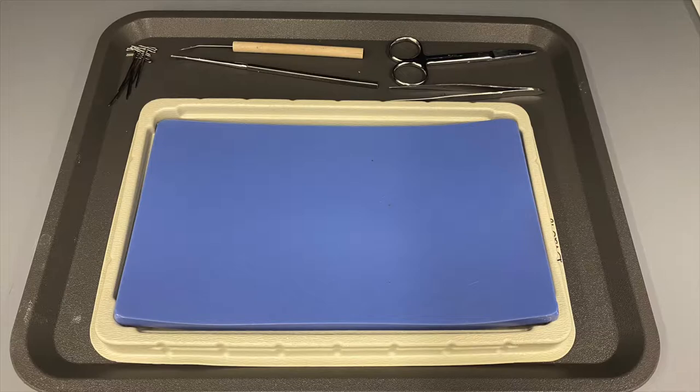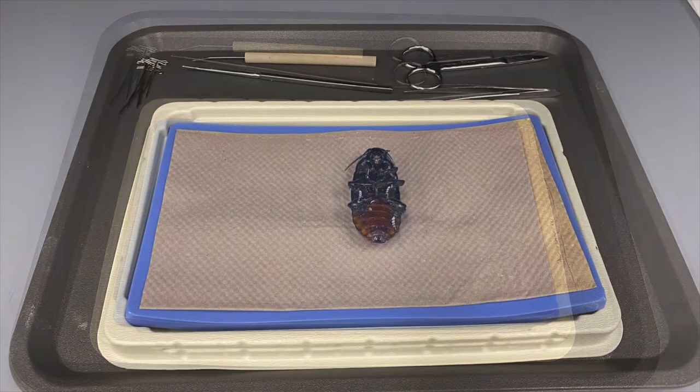The first step is to make sure you have gathered all of the necessary equipment. This includes your dissection dish, a pair of scissors, forceps, a probe, pins, and of course, a cockroach.